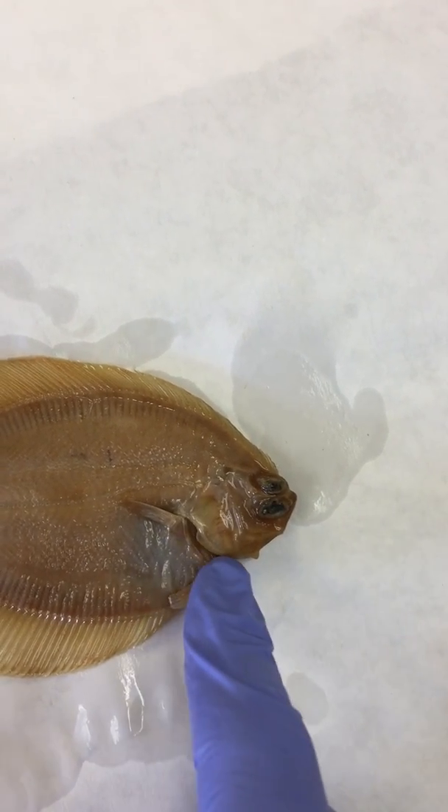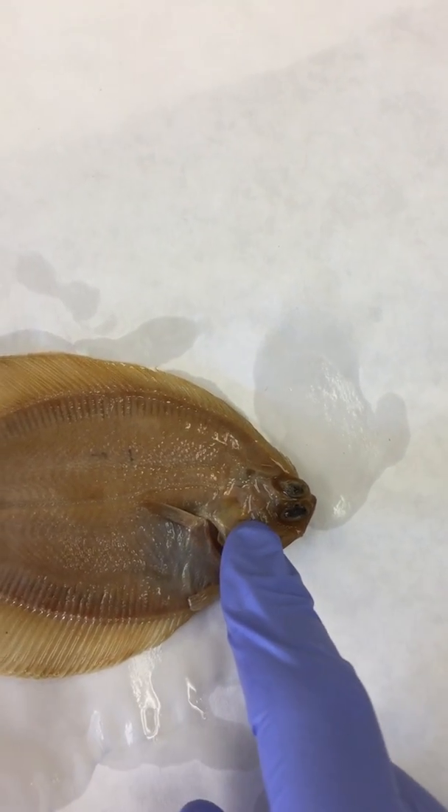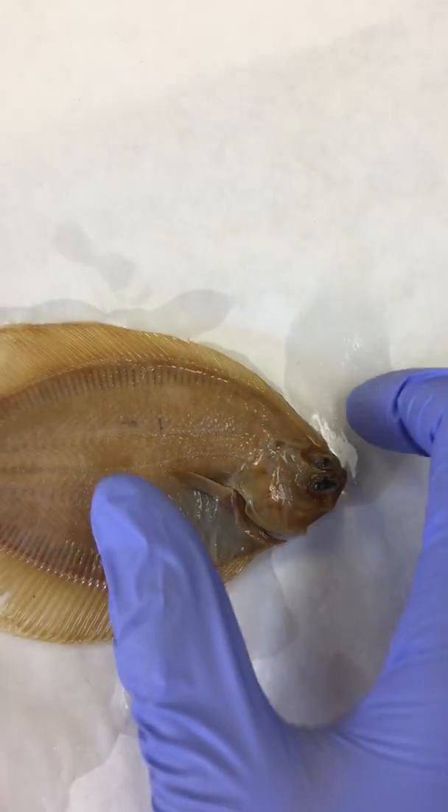The gill opening is here and the operculum, which covers the gills, is directly in front of that.